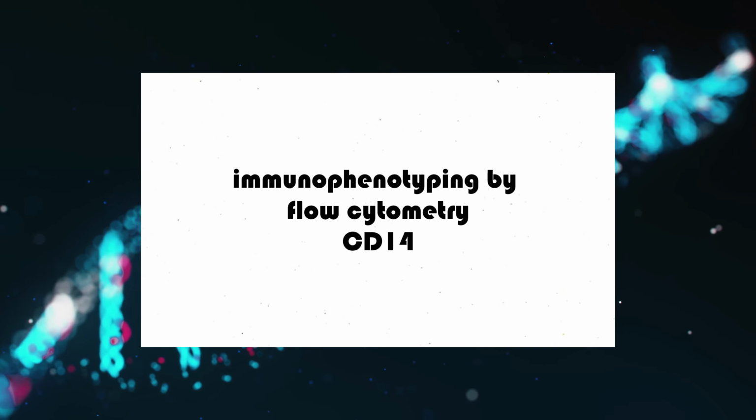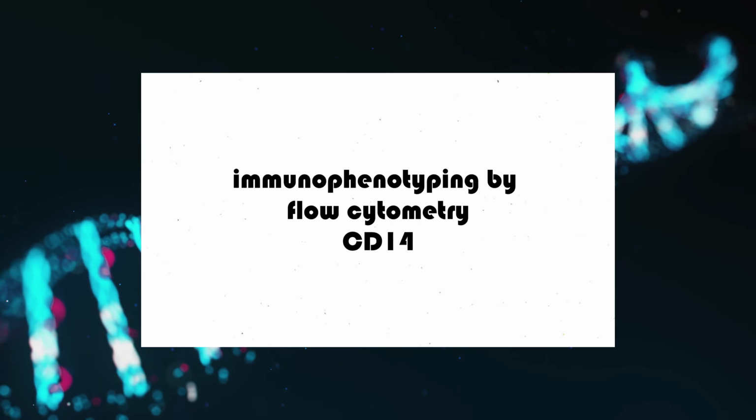We're diving into the fascinating world of immunophenotyping by flow cytometry, focusing on the CD14 test.